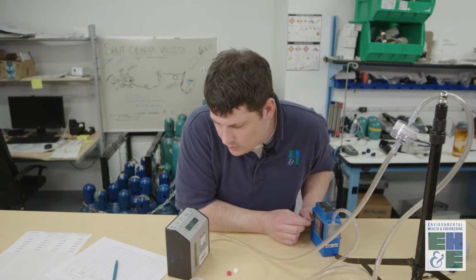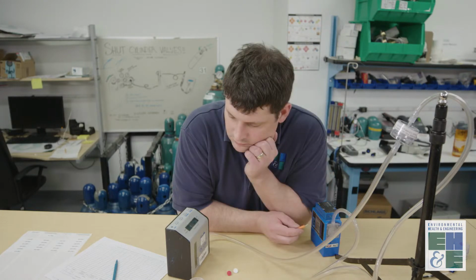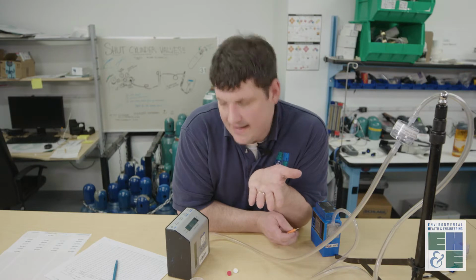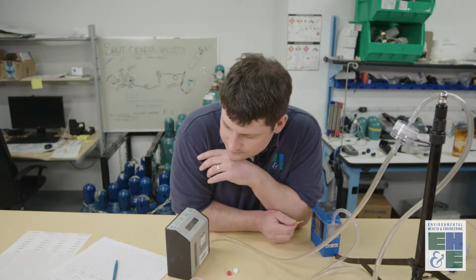I want to get a few readings in a row that are stable, and then record my on flow. So I'm at 1.48, and so I'm going to accept that, and that will be my on flow.